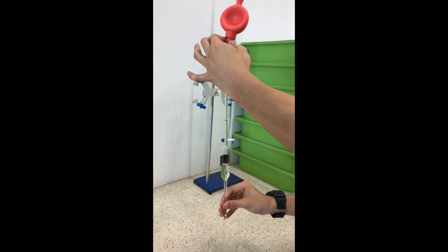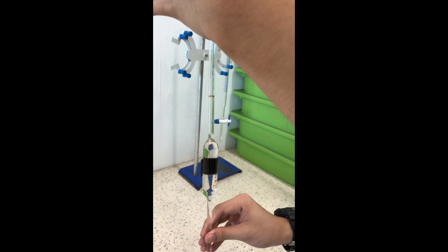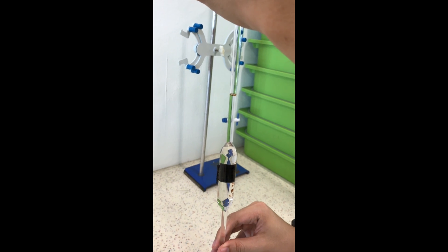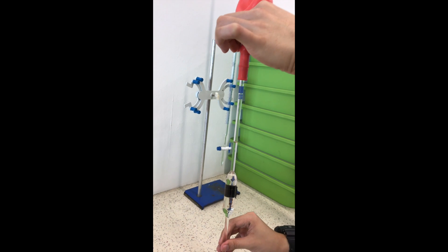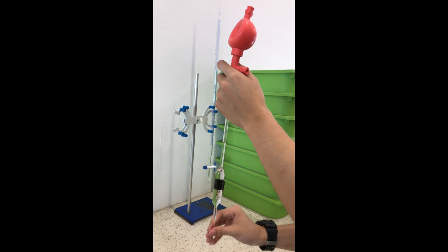Now, once the level of the liquid reaches the line, which stands for 25.0, we then remove the whole pipette from the solution and transfer this into a conical flask.